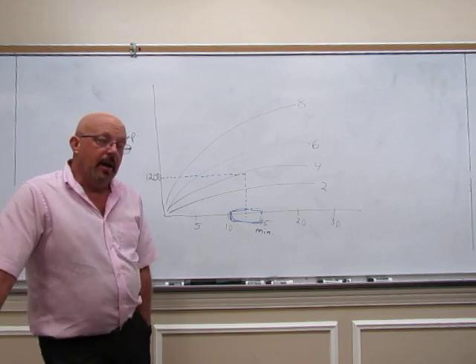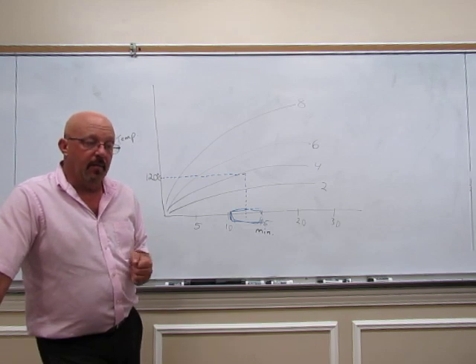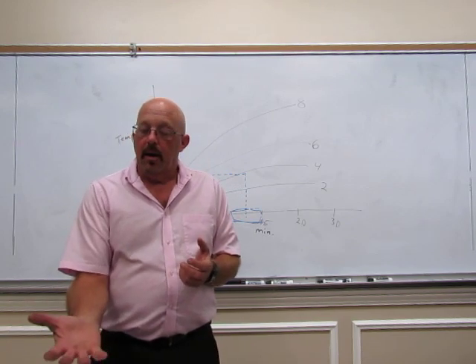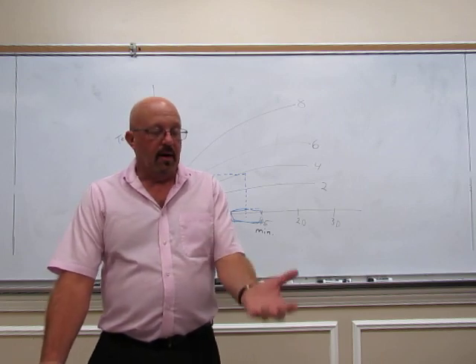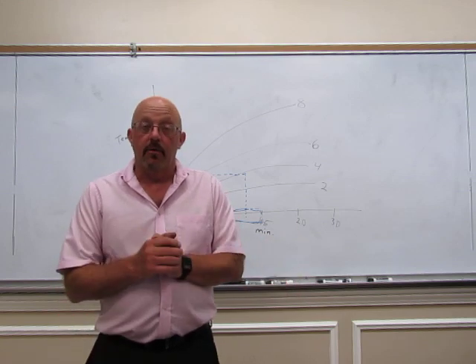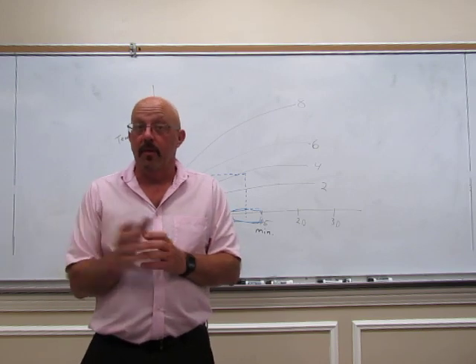Now the best way, if you want to identify a compound, let's say we've got some unknown, a bottle here that maybe somebody didn't label, and it melts at 100 degrees. Well, I've got another bottle here of something that is known, and we took a melting point of it, and it also melts at 100 degrees. Can we say those are the same thing? No. There's lots of compounds that melt at 100.